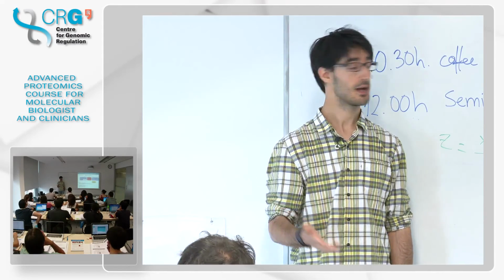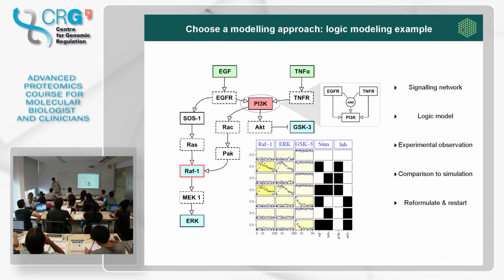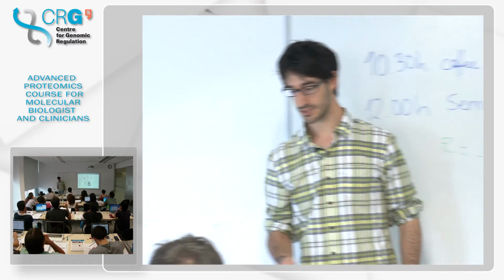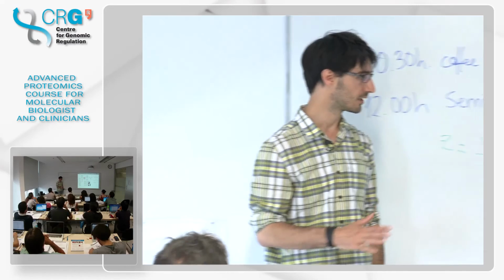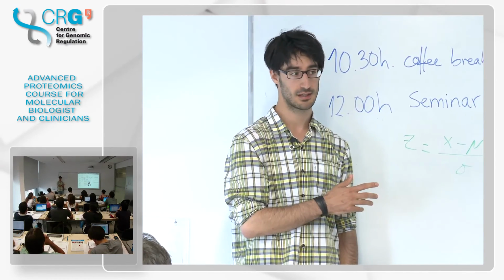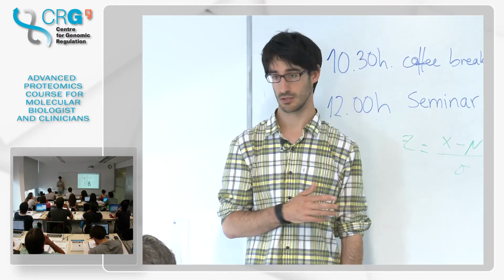So if you have a network like this here, you're going to be very confident about, for example, the behavior of this node, which is in between these two. So if you learn that this should be there because it's actually very important according to your data, then you're going to be able to make a safe conclusion about that because it's in between two measurements of yours. This is just a rule of thumb, and there's plenty that we can do here, and we will do it later when we see this. So this is the identifiability analysis that I mentioned yesterday, and that we're going to do later in detail.